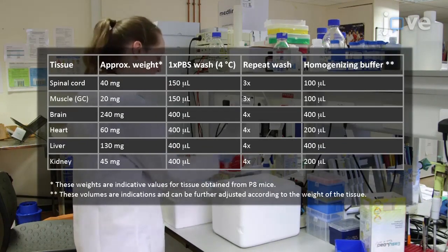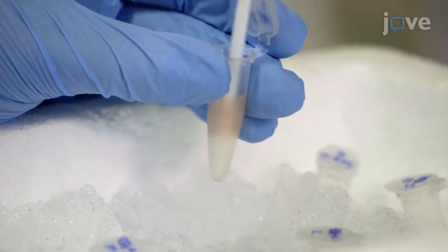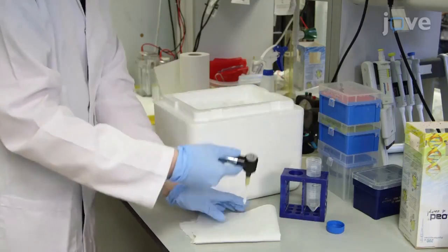Using a handheld electric homogenizer with a polypropylene pestle, homogenize the washed samples, rinsing the pestle in double-distilled water and drying with a clean tissue between samples.